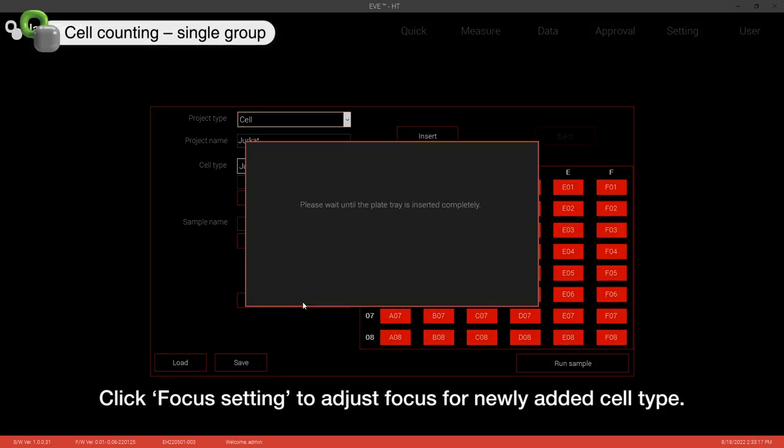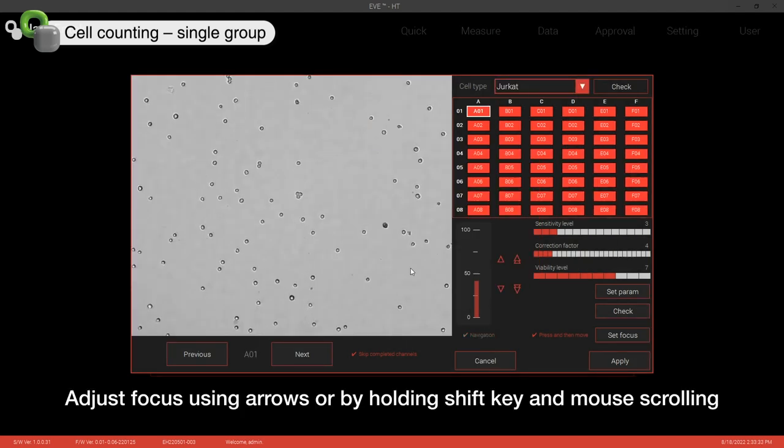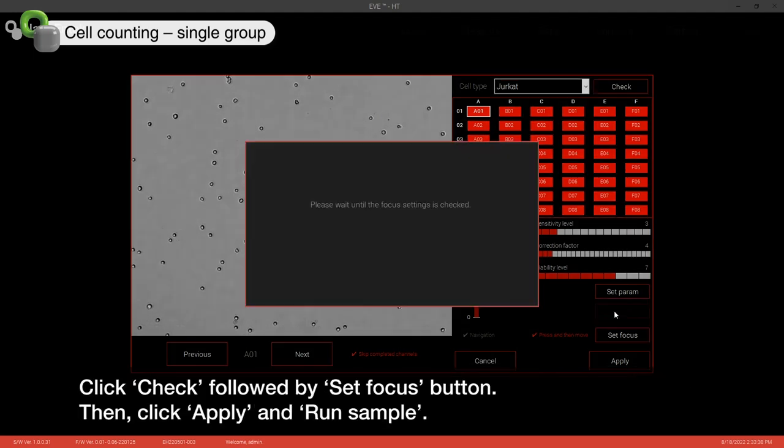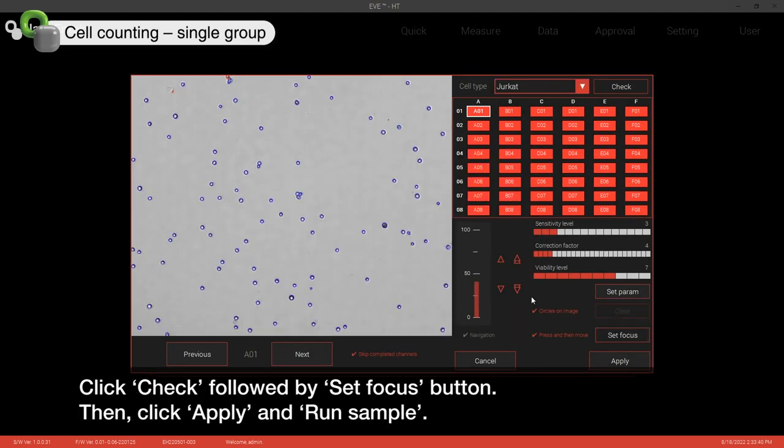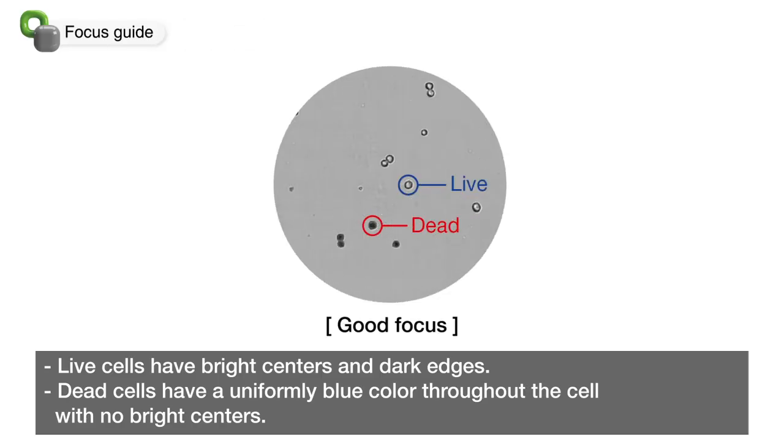Click Focus setting to adjust focus for newly added cell type. Adjust focus using arrows or by holding shift key and mouse scrolling. Click Check and then Set Focus button. Then click Apply and Run Sample. Please follow this focus guide for accurate measurement.